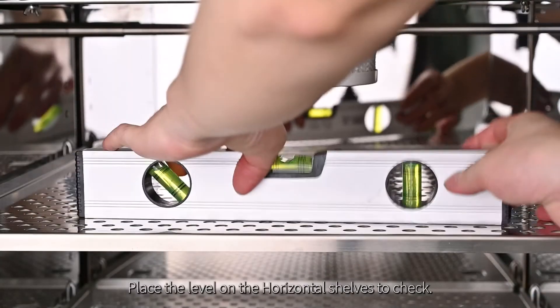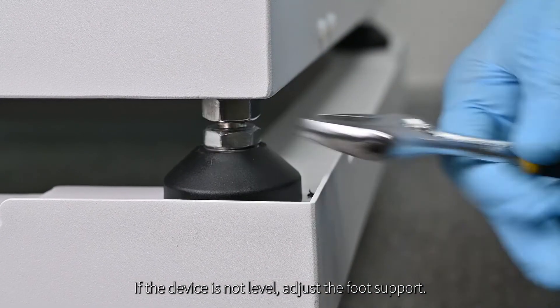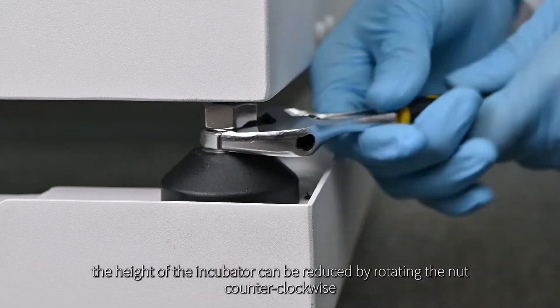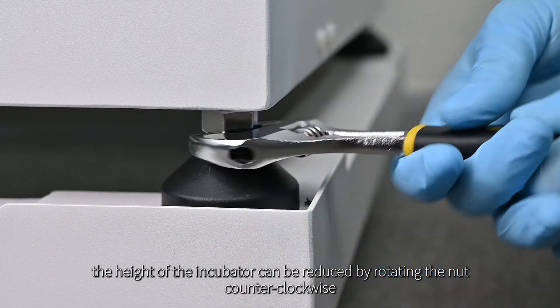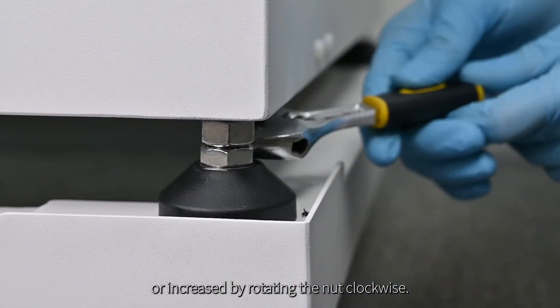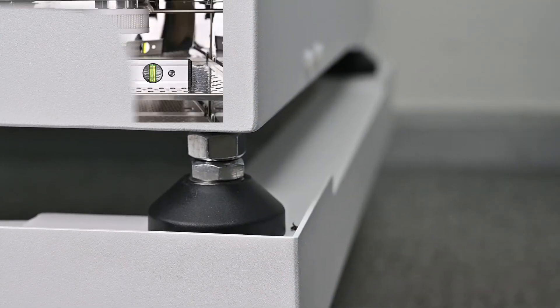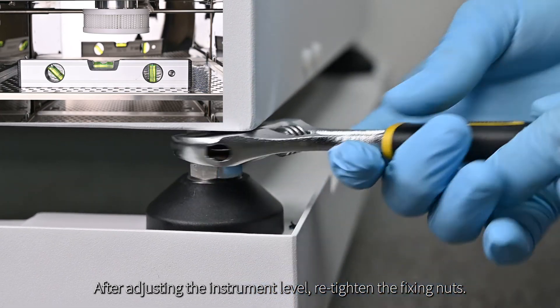Place the level on the horizontal shelves to check. If the device is not level, adjust the foot support. After loosening the top fixing nuts, the height of the incubator can be reduced by rotating the nut counterclockwise, or increased by rotating the nut clockwise. After adjusting the instrument level, re-tighten the fixing nuts.